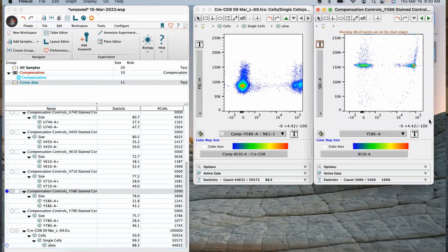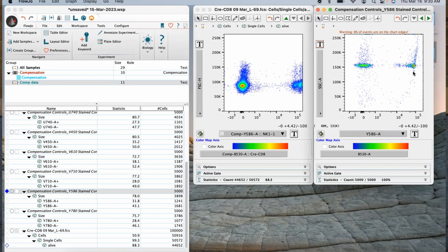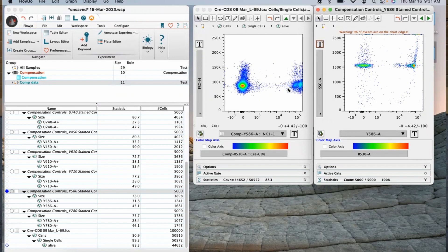If we go into our compensation control, looking at that same axis, you'll see they kind of sit around 10 to the 5, which means that our issue here is caused by our antibody on our cells being brighter than it was on our compensation control. And because of that, we're not compensating properly. So as you can see here, all of the stain on our cells is actually brighter than what we had on our comp controls, and that's why we have so many issues in this experiment — this area can't be properly compensated.